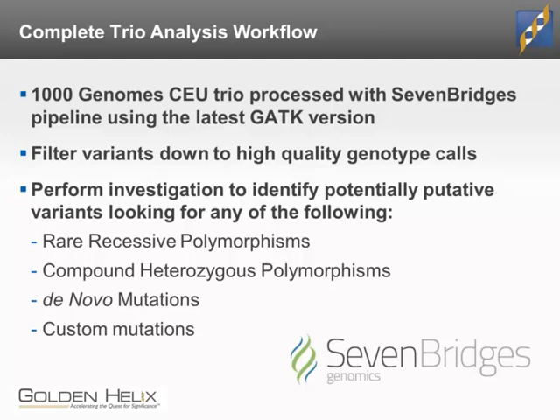From the filtered dataset, 3 different inheritance patterns are examined to look for potentially putative variants, including rare recessive polymorphisms, compound heterozygous polymorphisms, which I'll refer to as compound hets for short, and de novo mutations. If the child was a male, the variants on the X chromosome could be examined for an X-linked mutation. Other custom mutations can be sought as well using existing tools.